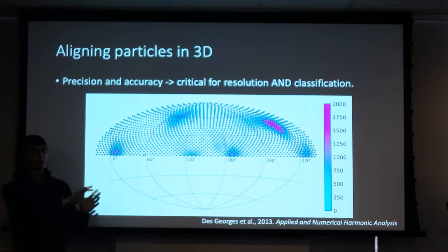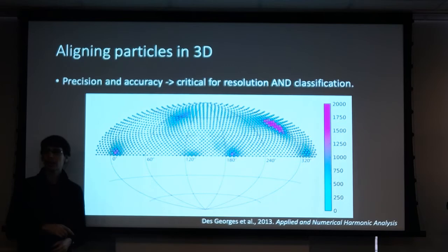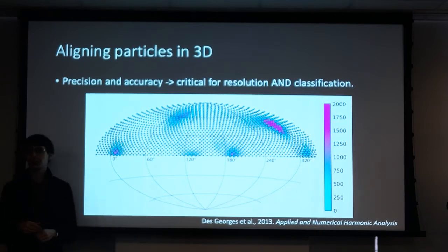And so when you're at coarse angles, it doesn't know which one of the two, and it switches between those two. And you can see that in a refinement output, 50% of particles are switching between classes. And then you go to smaller and smaller increments, 3 degrees, 1, 2 degrees, or less, and particles start switching between classes less and less.